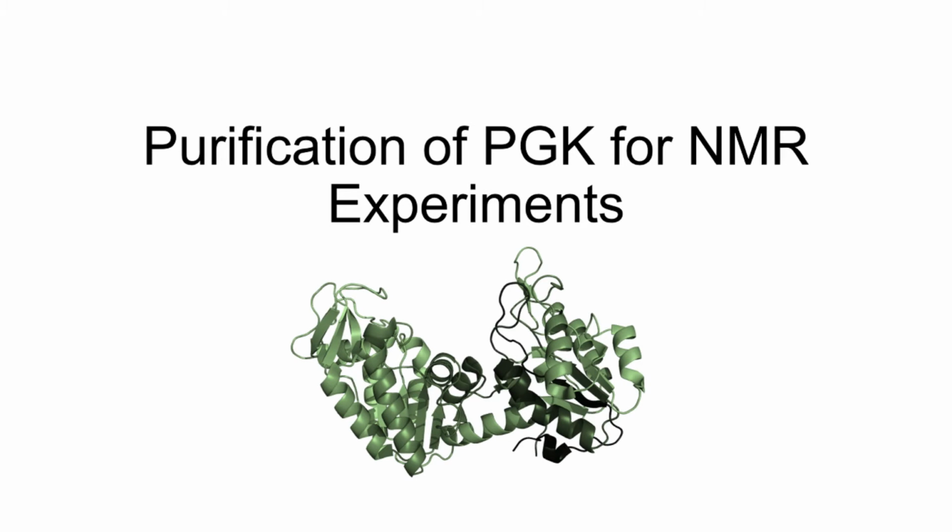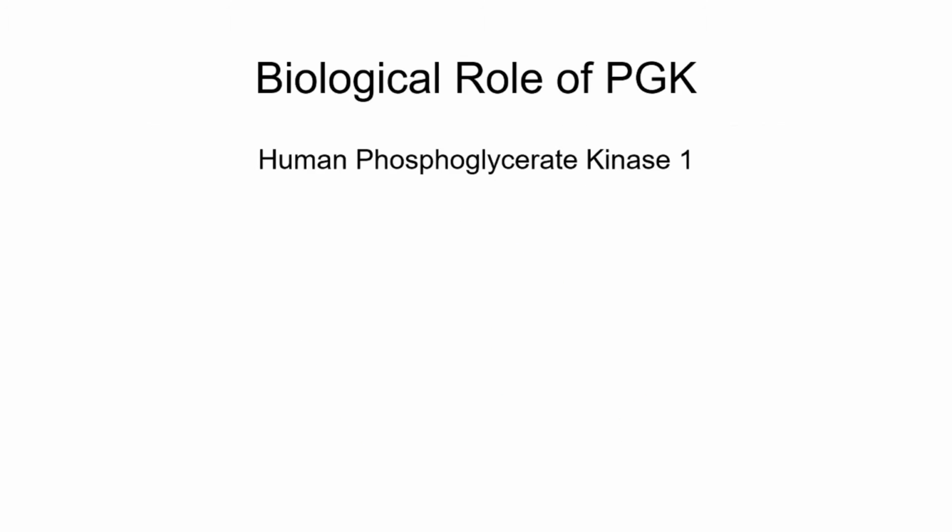Okay, so hello, I'm Philip, and I'm an undergraduate placement year student, and today I'll be talking about what I've been doing, and this has basically been producing lots of PGK for NMR experiments. When I mention PGK, I'm really talking about the specific isoform, human phosphoglycerate kinase 1.